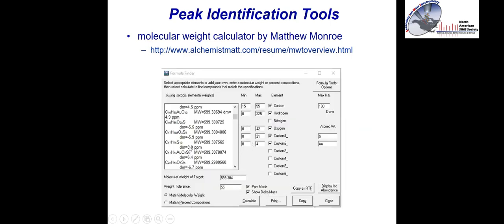So for example, if you look here, it came up with a C17H186O3S5. I don't know how you would even get that many hydrogen into something with only 17 carbons, but it did match very well with the given mass, but it's literally just taking all the atoms together and combining them. So it's important to know what the calculator is doing when you're trying to determine matches.